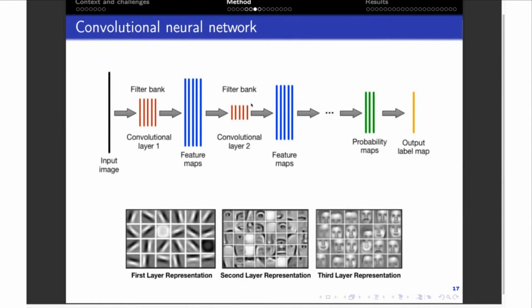By applying these layers sequentially, more and more complex features are extracted from the input image until a desired output is achieved. As an example, here at the bottom is an illustration of features encoded in a face recognition task. The first layer encodes basic features such as contours, and progressively, layer by layer, the CNN encodes eyes, noses, and finally the desired feature, the face. And in the end, a CNN enables a hierarchical representation of the data.